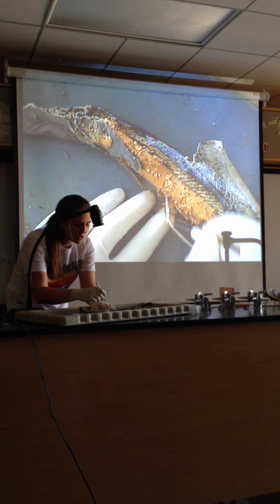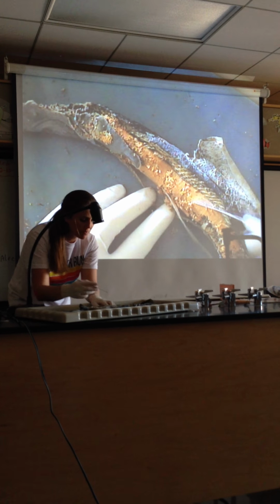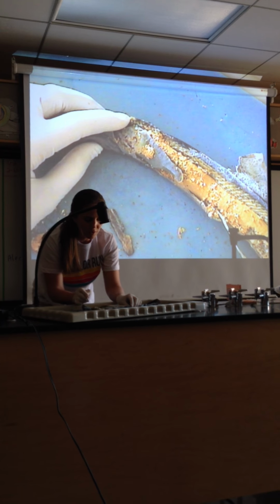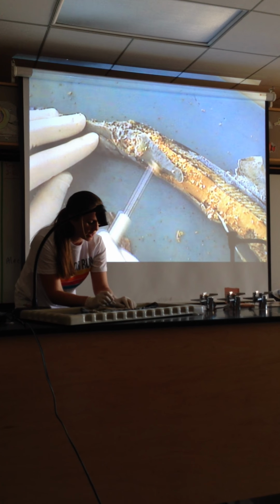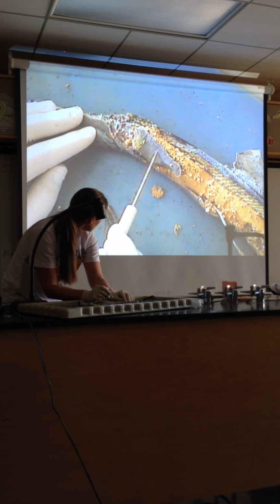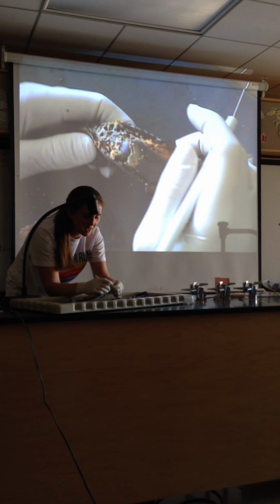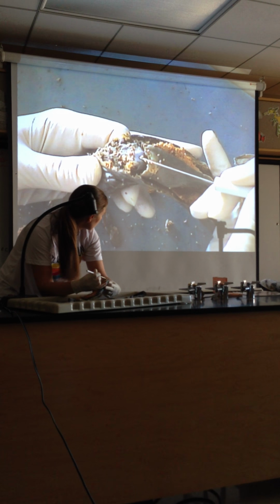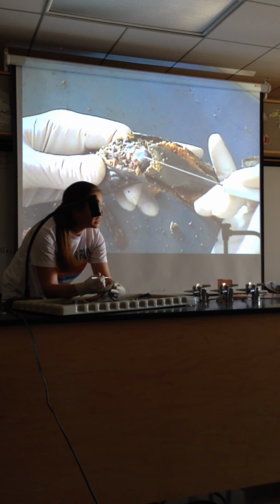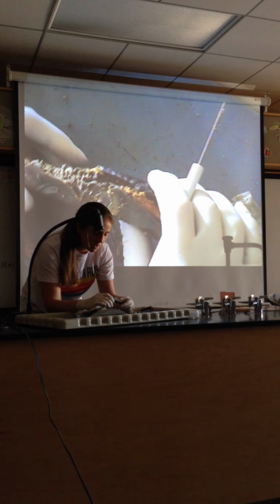And then, of course, this white structure is going to come out, and this is going to be your intestinal tract. If you follow from the cloaca all the way up the intestines, you're going to run into this gray-like structure right here. This is going to allow for buoyancy because it is the liver. Just anterior to the liver is going to be the heart, and it's in this sac right here. It's very primitive. There's not a lot going on in the heart area.